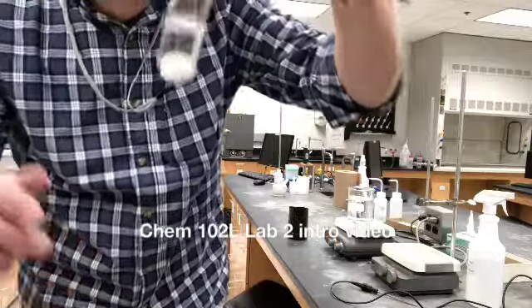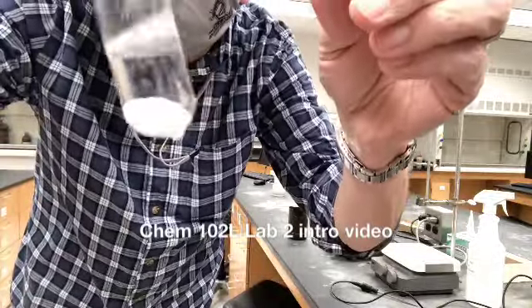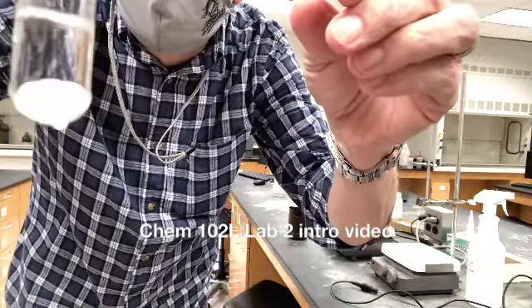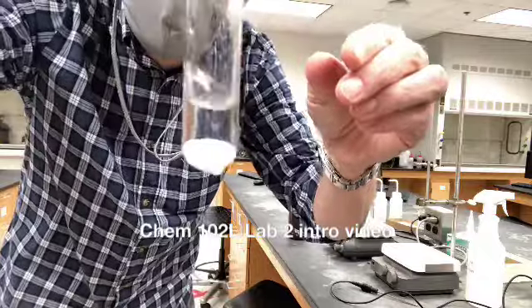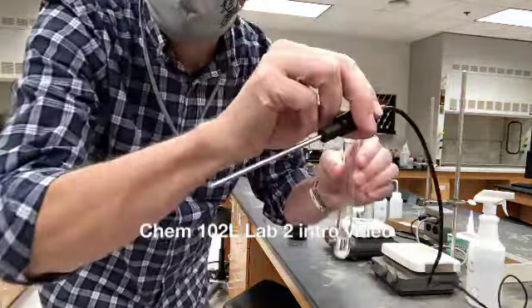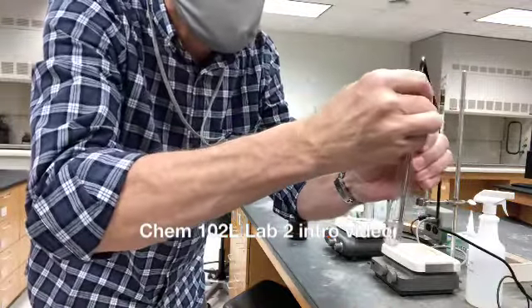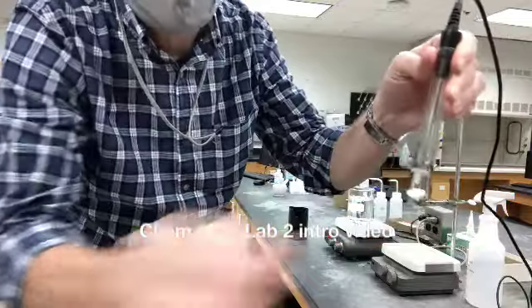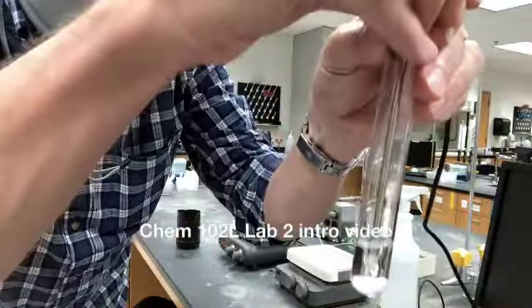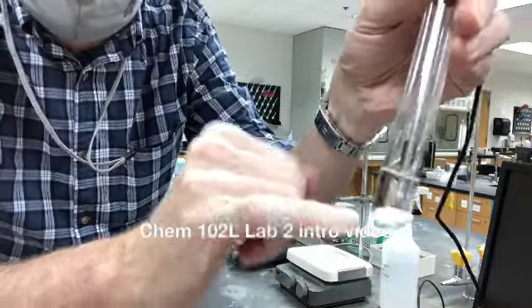So now I can show you that we've got a liquid here because we've melted it, brought it above its freezing temperature, and it's nicely melted, okay? So I can put our temperature sensor, just like we used in the previous lab, and I place it in with a rubber stopper, and that gets the temperature sensor in the center right near the stir bar.